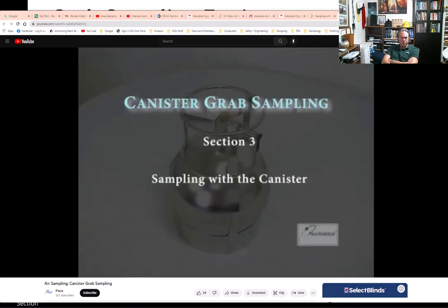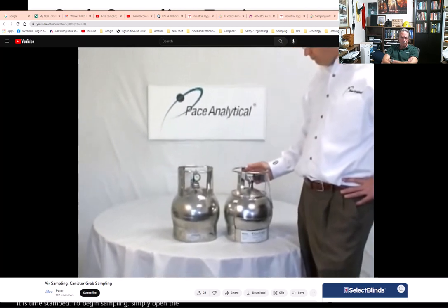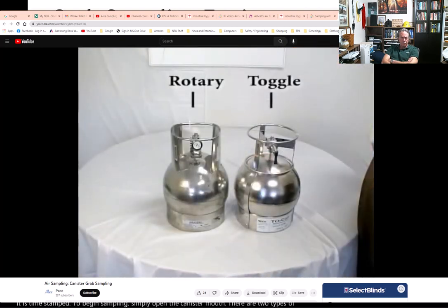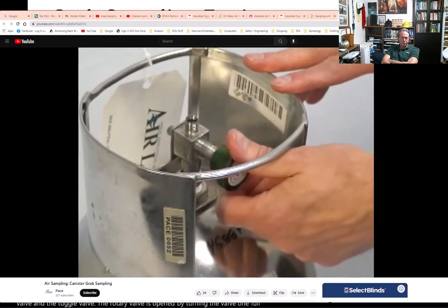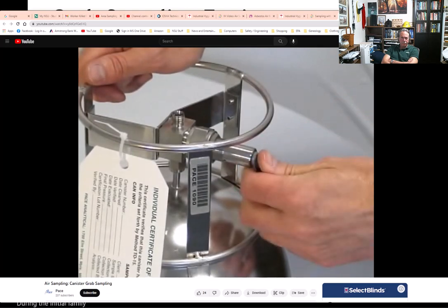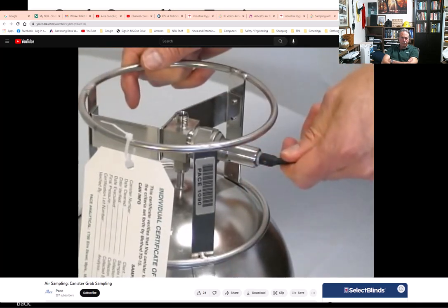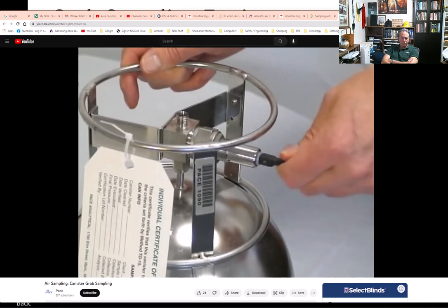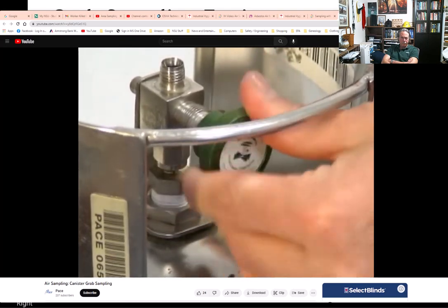Section 3: Sampling with the canister. To begin sampling, simply open the canister valve. There are two types of canister valves: the rotary valve and the toggle valve. The rotary valve is opened by turning it one full turn counterclockwise. The toggle valve is opened by flipping the toggle upward. The grab sample will fill in approximately 30 to 45 seconds. Once the rush of air has passed, close the valve in the opposite manner you opened it.